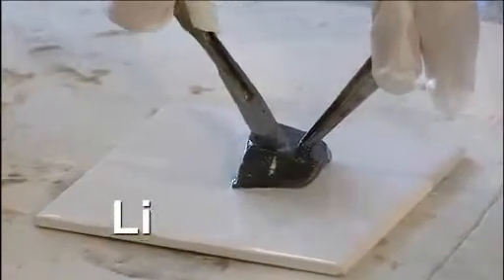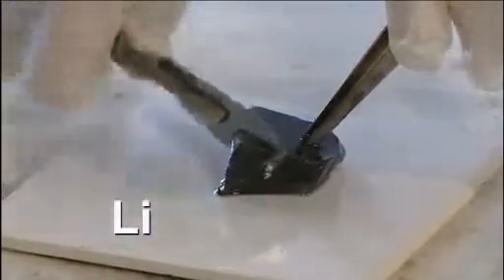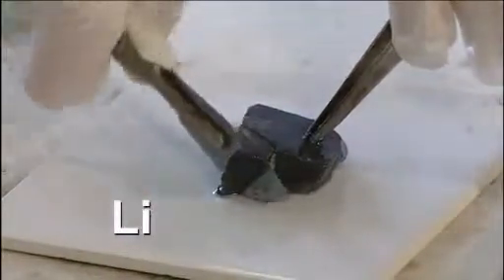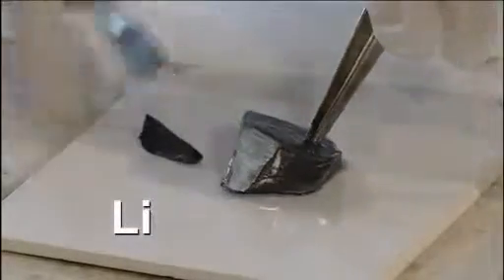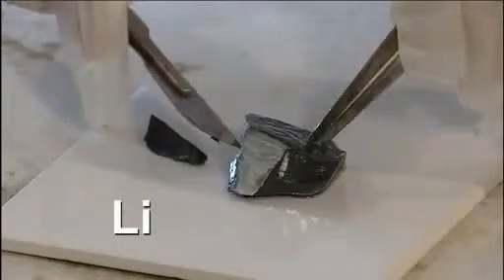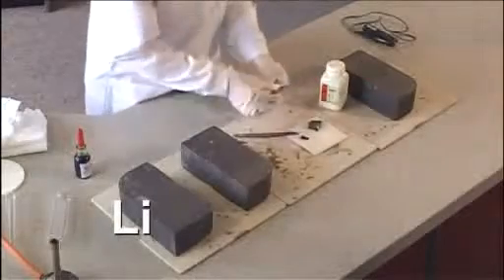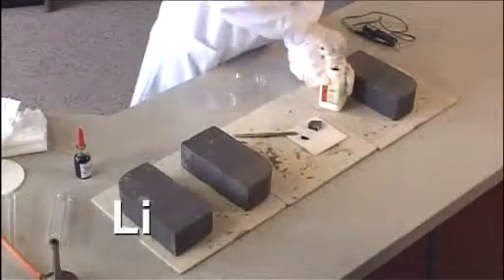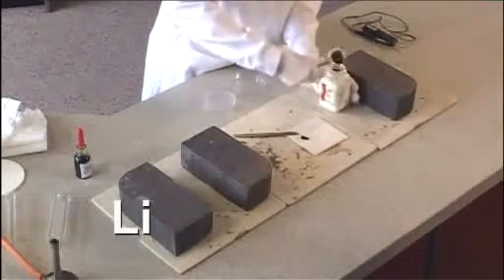As you can see with the lithium, it's quite difficult to cut. There we go. And you can see clearly the shiny silver surface. Over time, this does tarnish. I'm going to put this big chunk of lithium back into the container now.